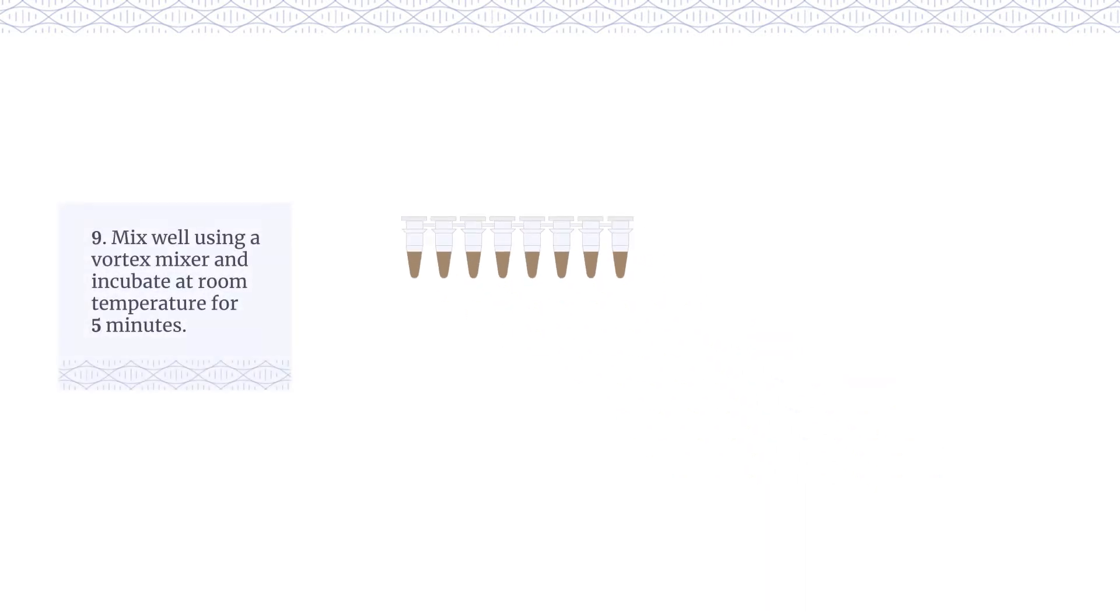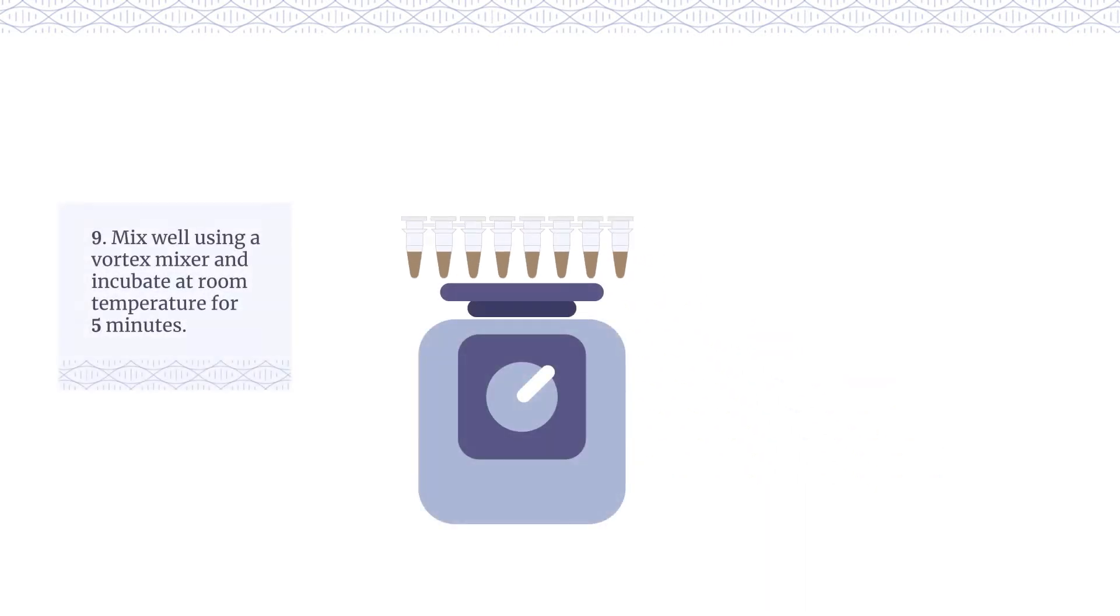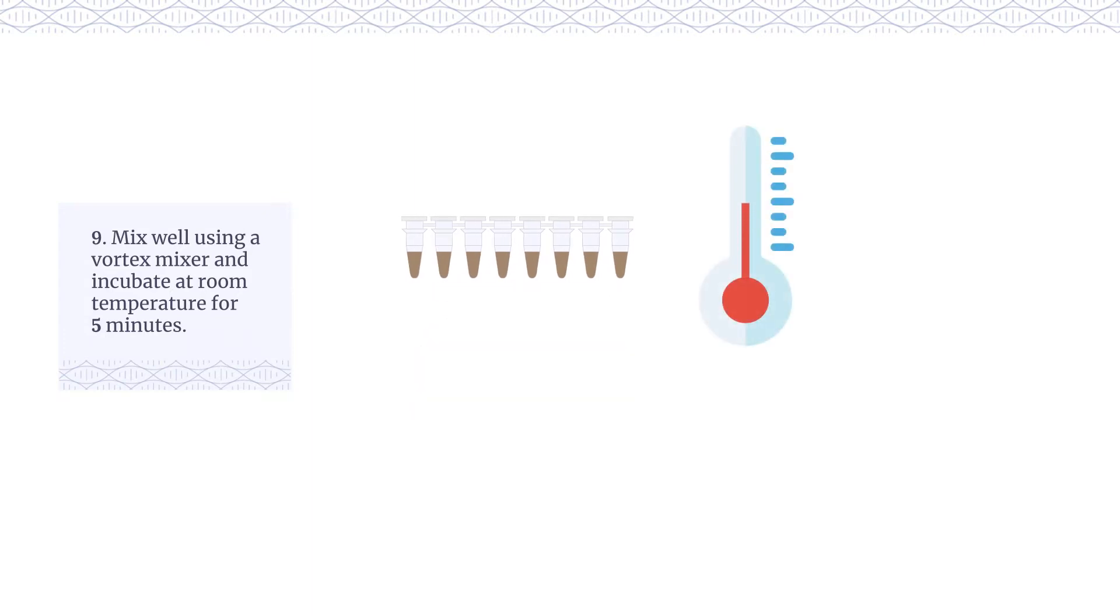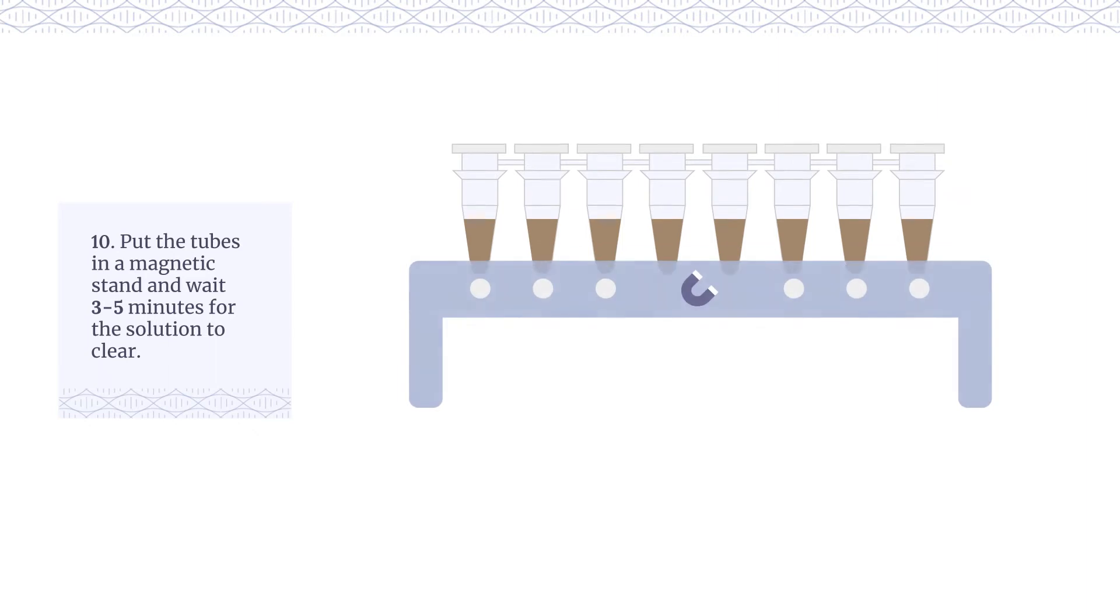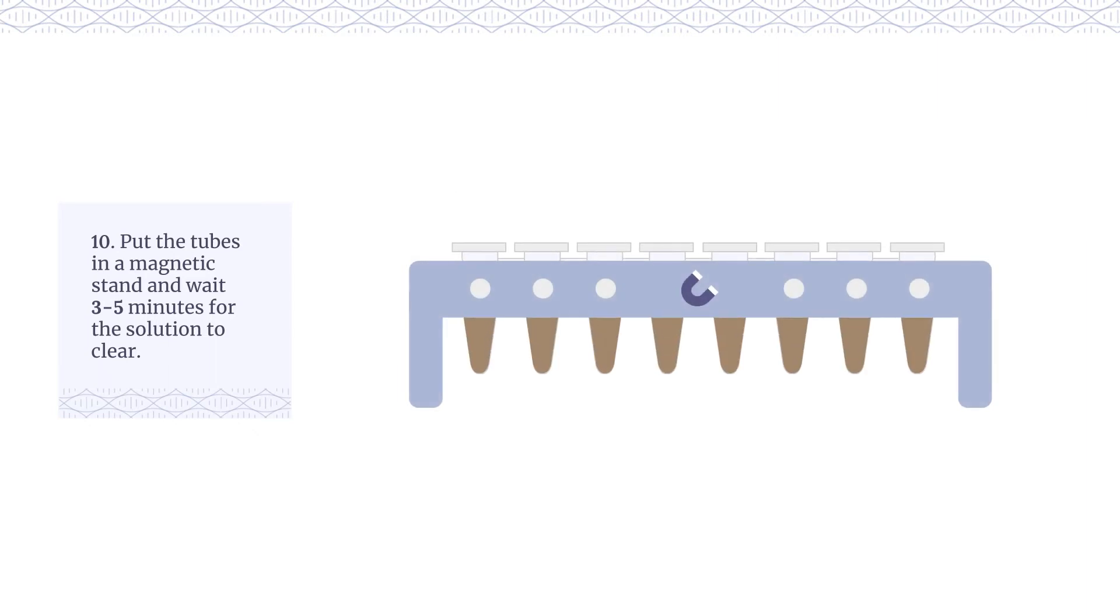Mix well using a vortex mixer and incubate at room temperature for five minutes. Put the tubes in a magnetic stand and wait three to five minutes for the solution to clear.